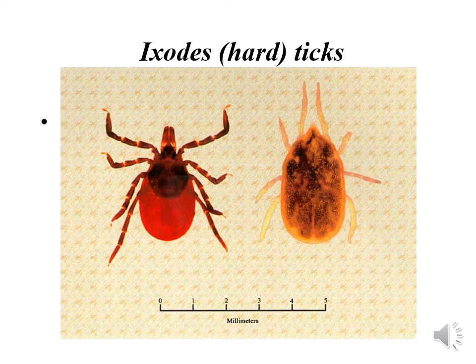If you look at the diagram on your left, you can see that there is a dark, tough structure limited to the thorax of the tick. This is known as the scutum, and the scutum is not stretchable. And then the body, for example, of the female tick is very inflatable, very soft, leathery. It could be expanded so that the tick can take a lot of blood, because these female ticks need blood to produce plenty of eggs.